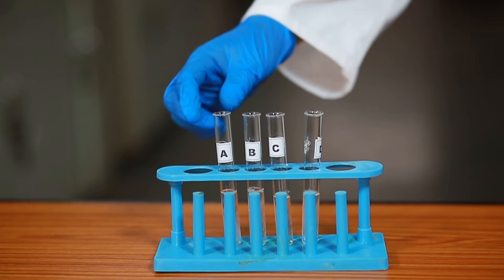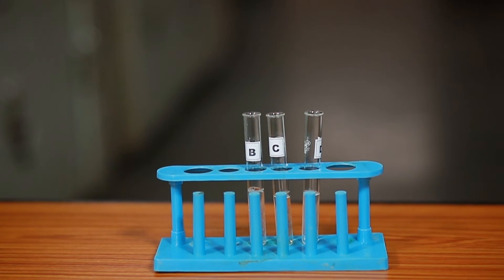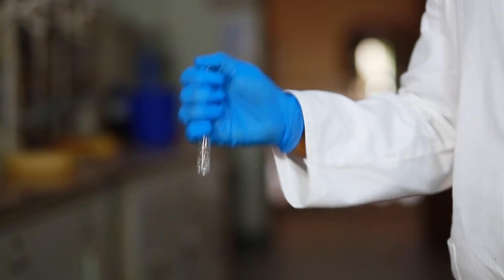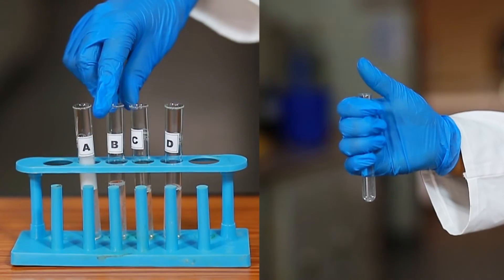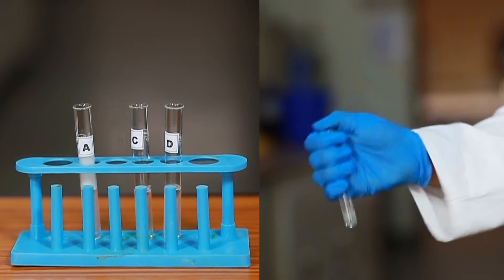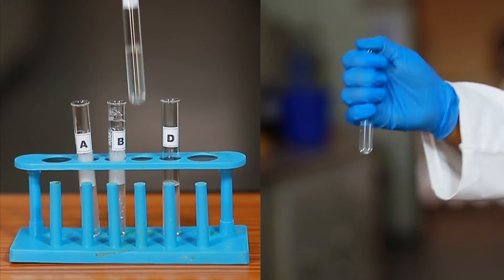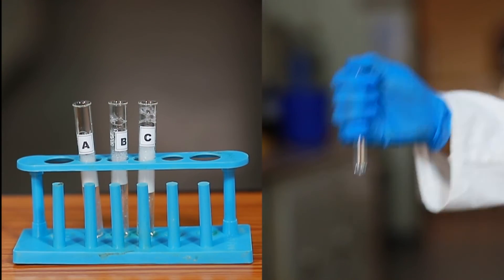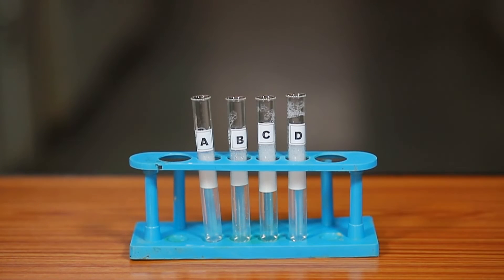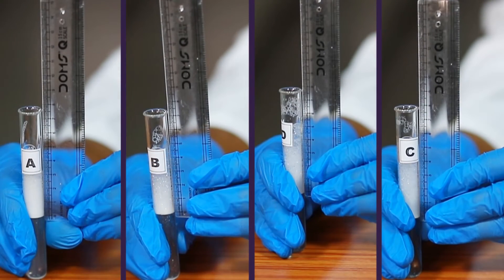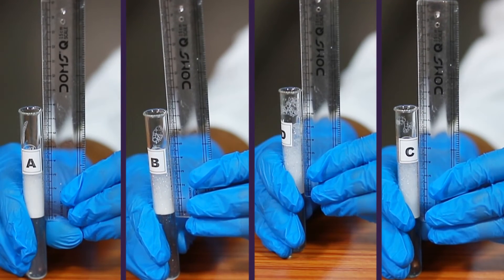Take the test tube labeled test tube A and shake it 10 times by placing the thumb on its mouth. Repeat the steps with the remaining three samples of soap solutions. By shaking the test tube, foam will form. Using a measuring scale, measure the length of the foam produced.